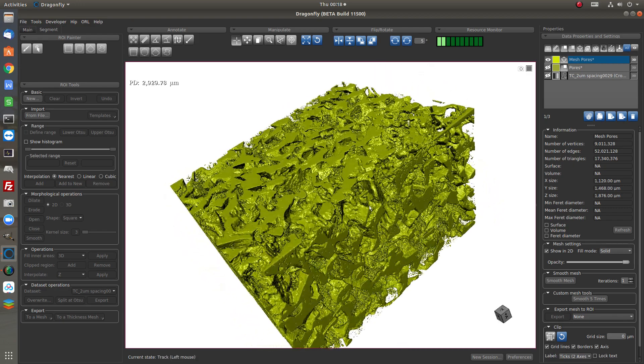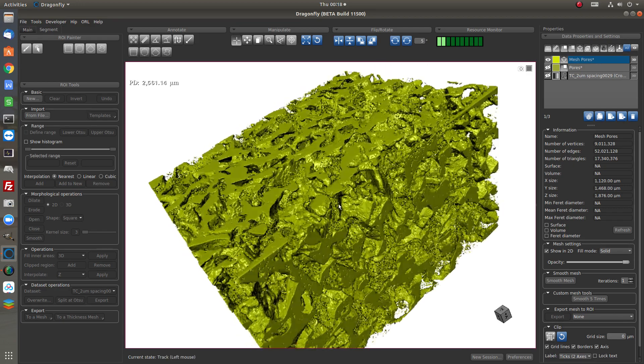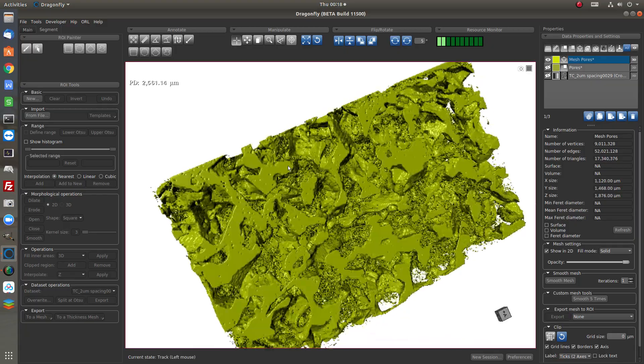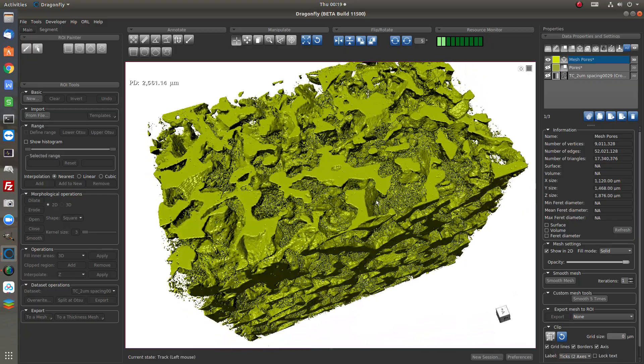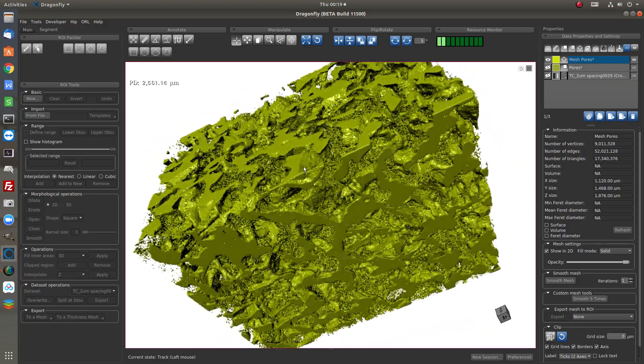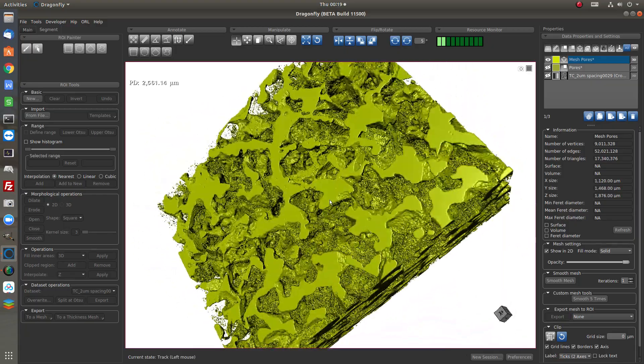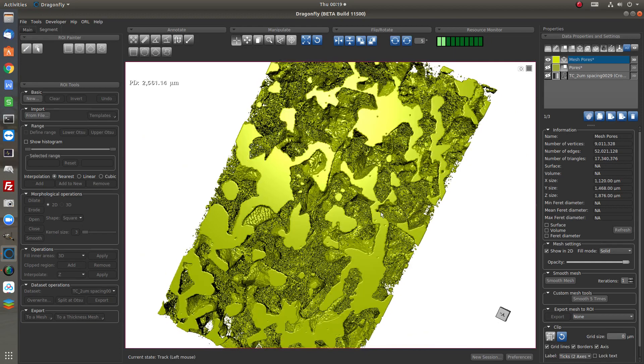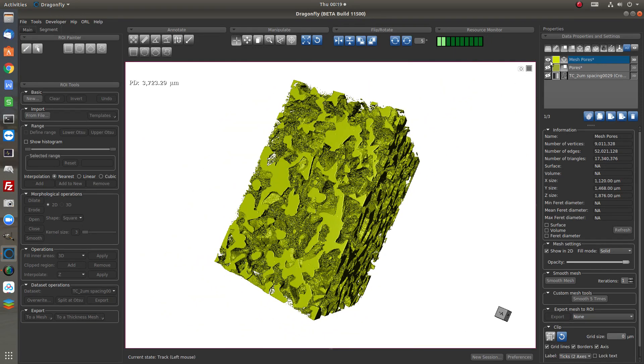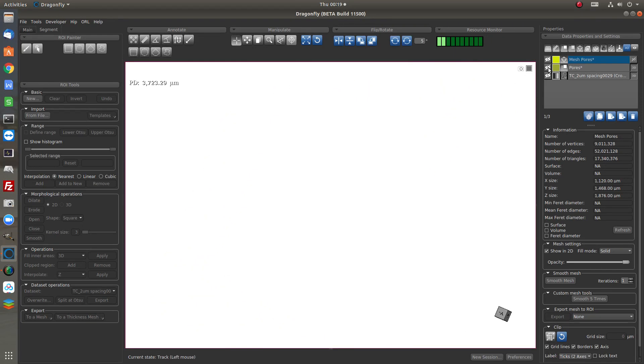Of course there are many big pores and small pores. If we want to remove the small pores we could do it before the mesh.